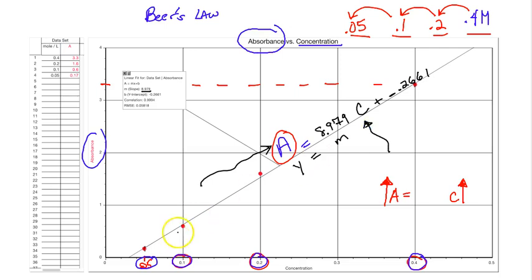So what you did in lab is you took your 4 or 5 solutions, some periods did 5, entered them into the graph, and now we have this Beer's law graph. We're going to use this graph, just like our homework, to answer a question about the absorbance of the unknown. If you remember, you massed out brass shot, little BBs, on a plastic weighing boat. Maybe the mass was 1.47 grams. I'm just making that number up.